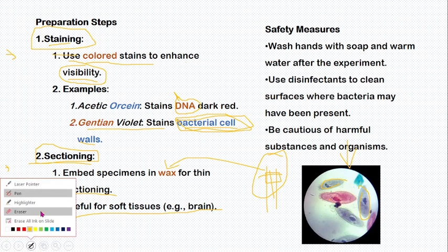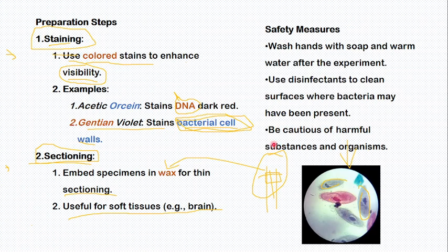Procedure you are looking at here, okay. By doing sectioning and staining, you should take some precautions. Otherwise, you are going to observe under the microscope things you put in that are not in the sample. Suppose you have stool and you need to observe if it has cholera. Now the cholera agent, I told you, is Vibrio cholerae. In a previous video I taught you this is caused by bacteria, specifically Vibrio cholerae. Suppose there is Vibrio cholerae in this sample.